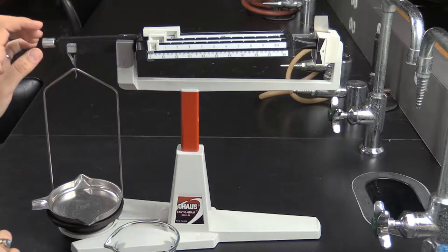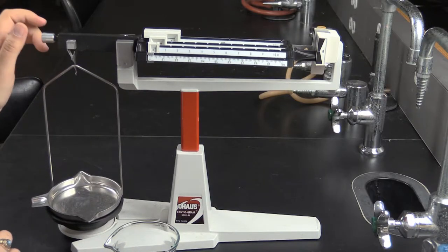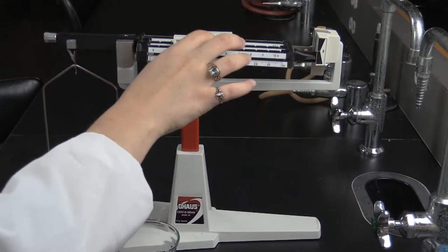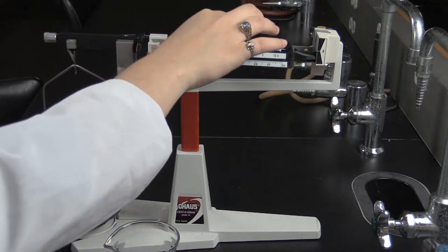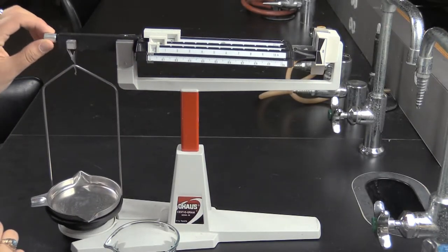However, with this style of balance, it will take a bit longer. First, slide all of the sliders to their zero marks. These can be found on the far left.